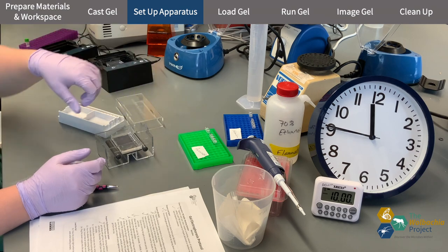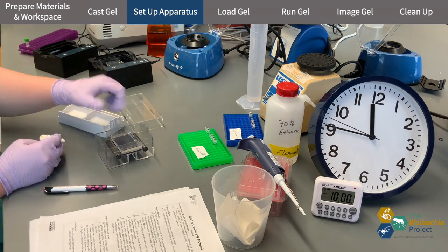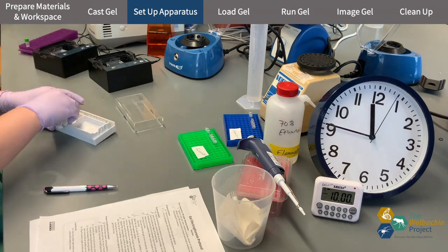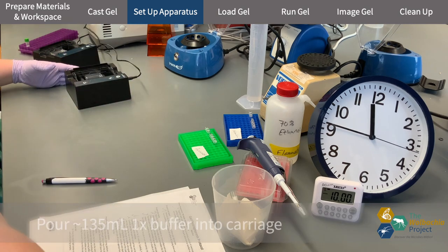This is what a properly set up Mini One buffer tank looks like. Add the buffer tank to the apparatus and lightly push it in to make contact with the rivets.